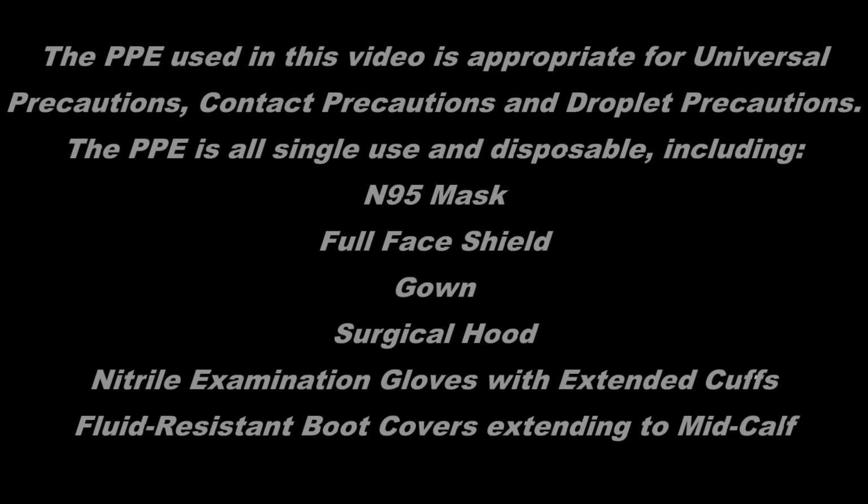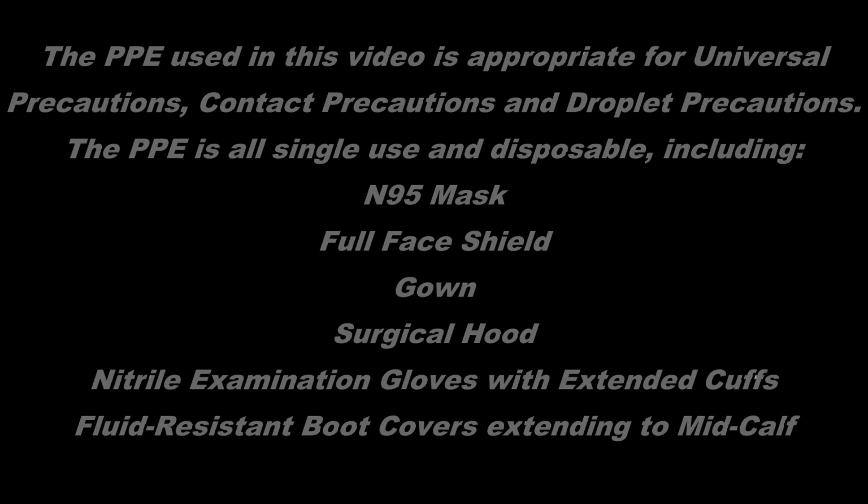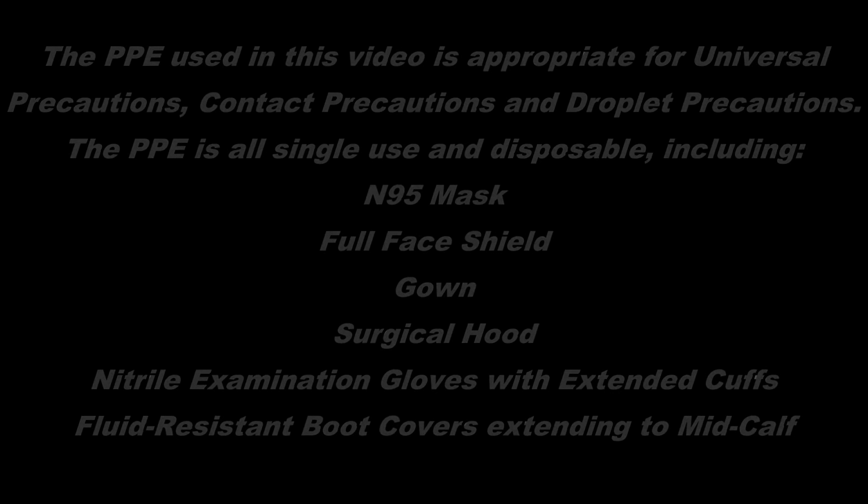The PPE is all single-use and disposable, including the N95 mask, a full face shield, a fluid-resistant gown that extends to at least the mid-calf, a surgical hood, nitrile examination gloves with extended cuffs, and fluid-resistant boot covers that extend to the mid-calf.